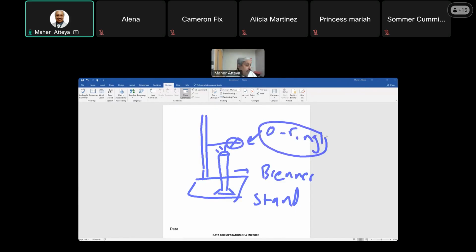Okay, to support this crucible, we'll have to have a triangle. Let me change the color here. You'll have a clay triangle, ceramic, to put your what? Put your weighing dish number one with your mixture, that's dish one. That's dish one, okay? You will heat this one here first.